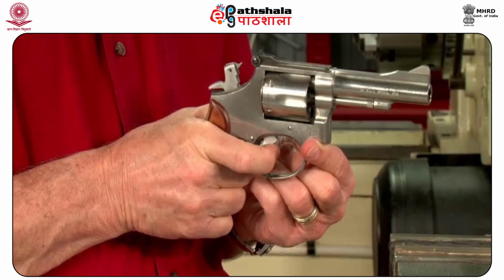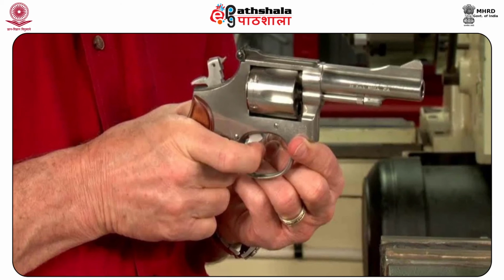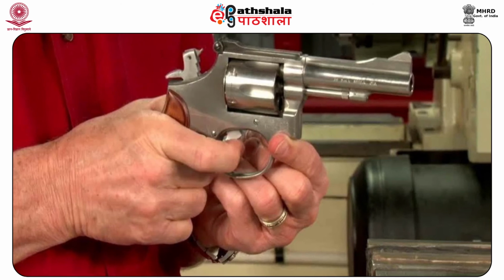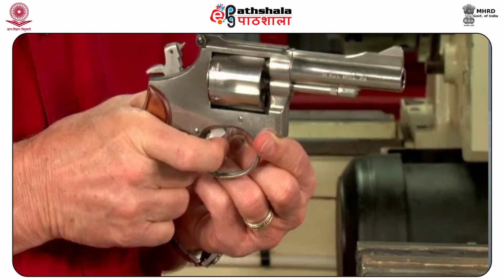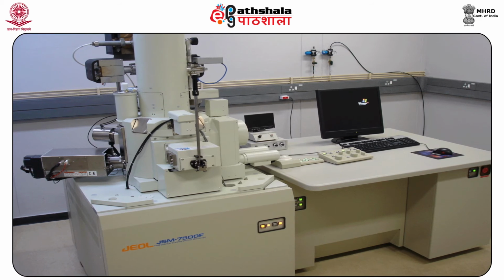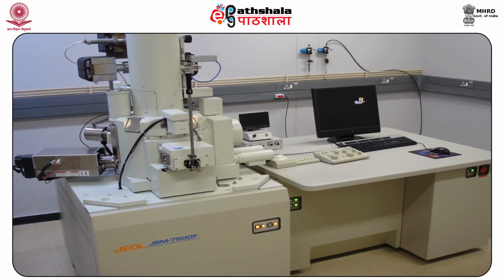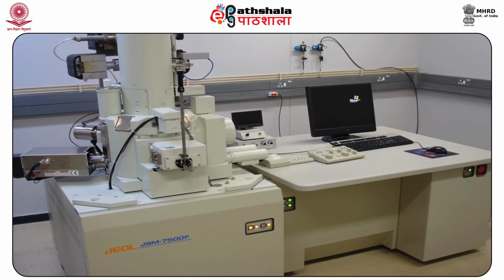Along with it, in this chapter, we have discussed that gunshot residue particles may be found in the barrel as well as in the chamber of the weapon, along with the outside of the barrel. And we have come to know that the most successful technique to date for the analysis of gunshot residue particles is the scanning electron microscope with an energy dispersive X-ray analyzer.